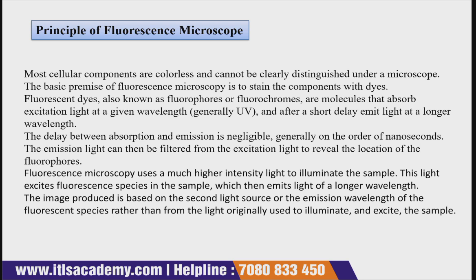The delay between absorption and emission is very negligible, generally on the order of nanoseconds, which you can easily neglect. The emission light can be filtered from the excitation light, and with the help of this they reveal the location of the fluorophores.